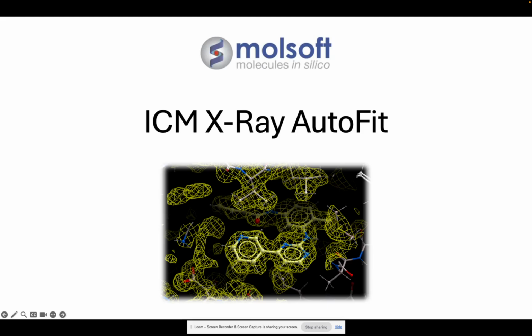This video describes how to do ICM Autofit for X-ray electron density maps. The ICM X-Ray Autofit method is an automated way to fit a ligand into electron density. The tool combines the powerful ICM docking algorithm with an electron density fitting algorithm.